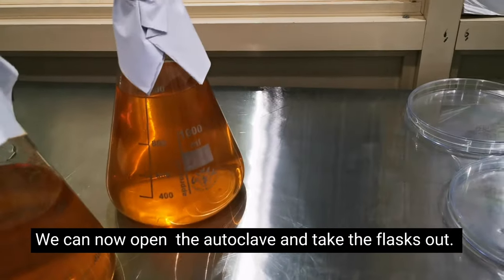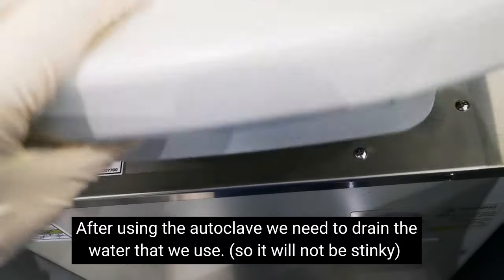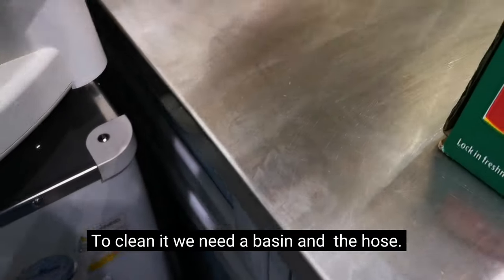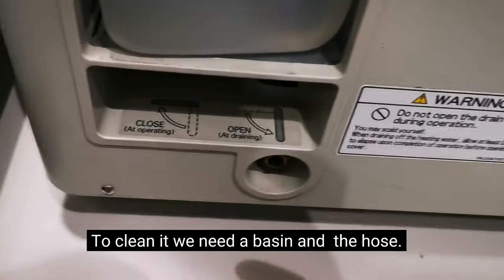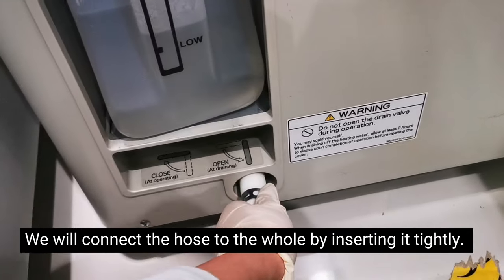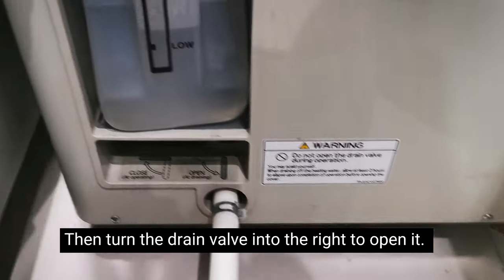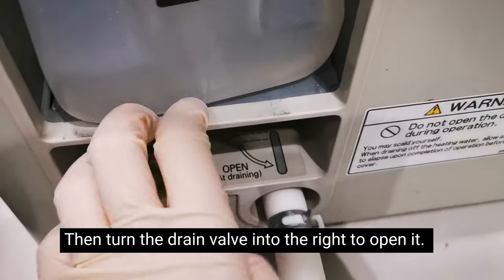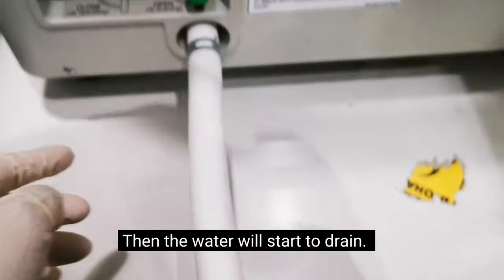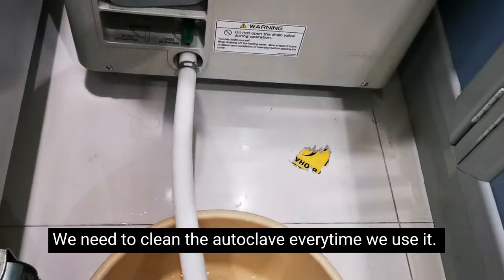Close the autoclave again. We need to clean it so the inside doesn't smell bad. Get a basin, and using the hose that came with the autoclave, connect it to the drain hole at the bottom — make sure it was closed so the liquid doesn't spill. Attach the hose there and drain the water. It may smell because of agar that has burned, so you must clean it after every use. Drain all the water until it's clear.